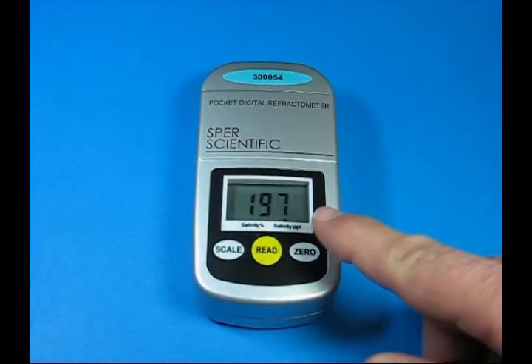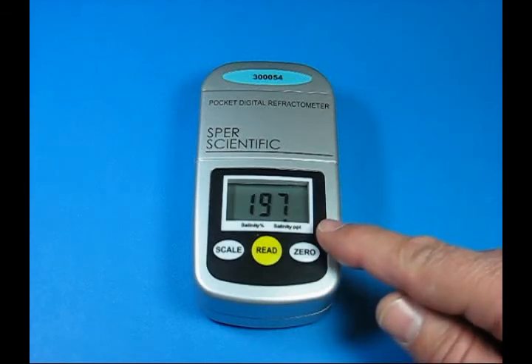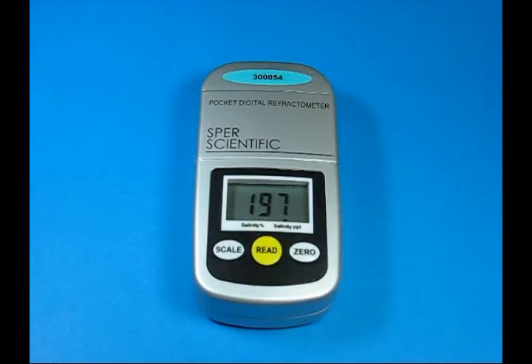Press read again and we have the solution — in this case salinity in parts per thousand. This unit would have a second scale, so that we can also read salinity percentage.